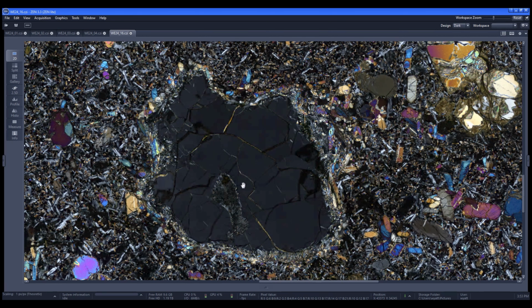And this quartz grain did not form in the magma. It was incorporated into the magma. It was pulled into it. So this, since it's a large individual grain, would be known as a xenocrystal. If it was multiple grains fused together, essentially a rock fragment, it would be a xenolith. Since it's one large individual grain of quartz, it's a xenocrystal.